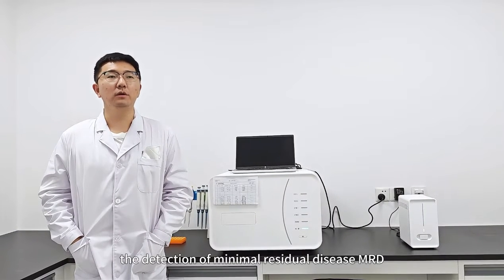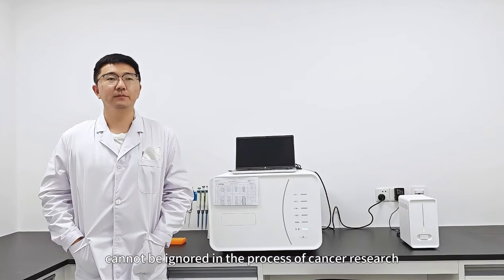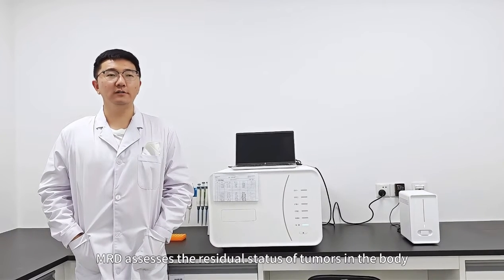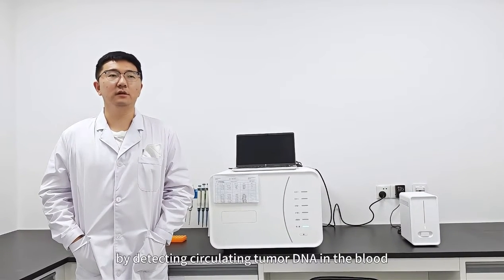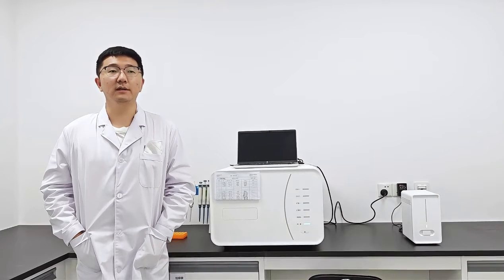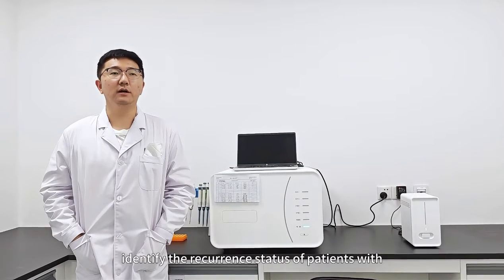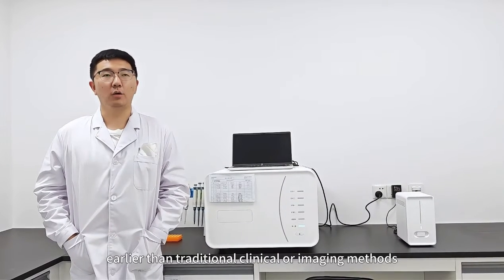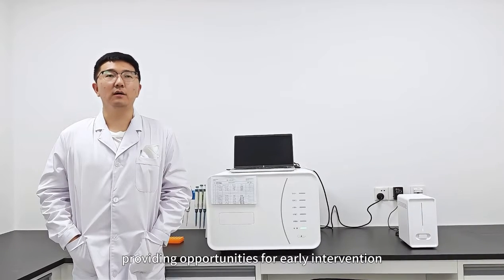In addition, the detection of minimal residual disease (MRD) cannot be ignored in the process of cancer research and cancer patient monitoring. MRD assesses the residual status of tumors in the body by detecting circulating tumor DNA in the blood. ctDNA-based MRD detection can identify the recurrence status of patients with early-stage non-small cell lung cancer earlier than traditional clinical or imaging methods, providing opportunities for early intervention.